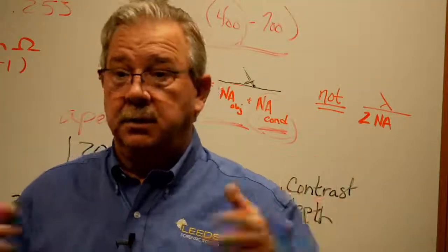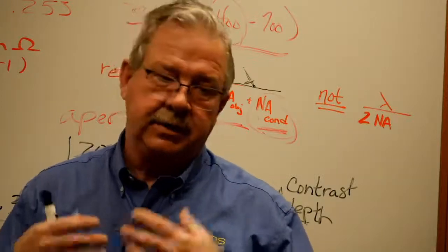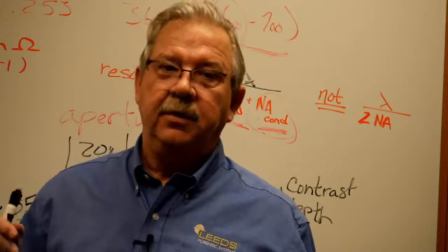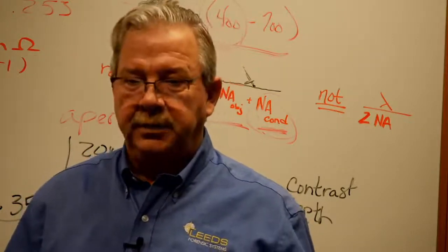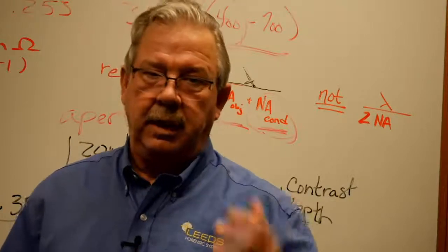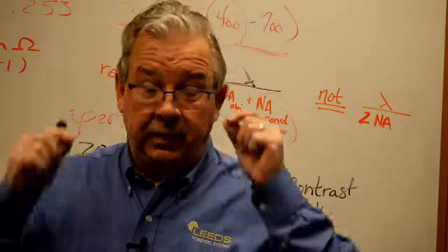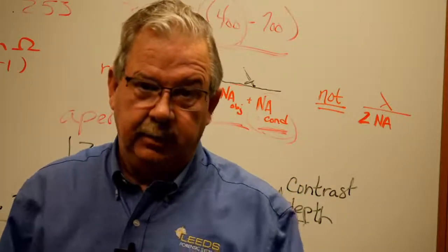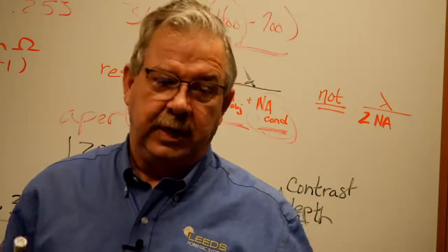No, no. Contrast is huge. The human eye needs a lot of contrast to be able to resolve an image. All I'm suggesting to you is you want to find the right balance between contrast and depth and resolution. Okay? One of the neat things that we have today that we never had in the past, we have the ability to get extended depth of field images through a camera.